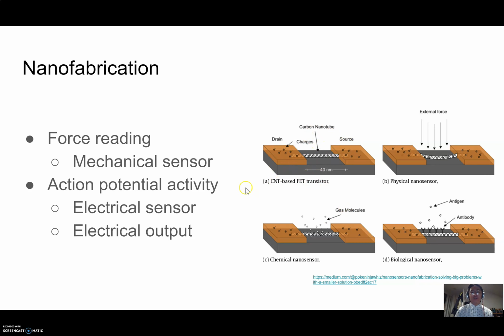To have mechanical sensors, for example here, that could read how much force each heart cell culture was implementing, and also maybe an electrical sensor as well, to collect that information without doing the actual fluorescence. So that was the idea of this project. Doing research on this took quite a while, to implement that within the bottom of my design.